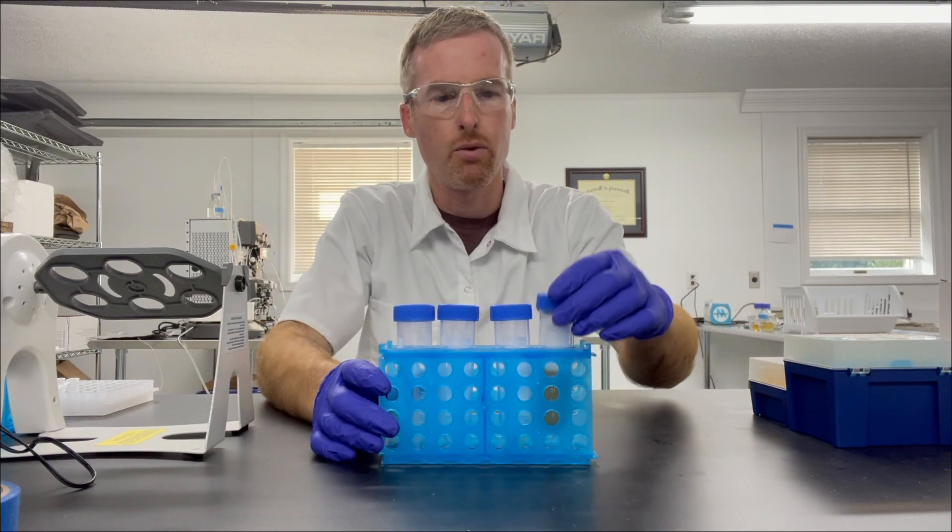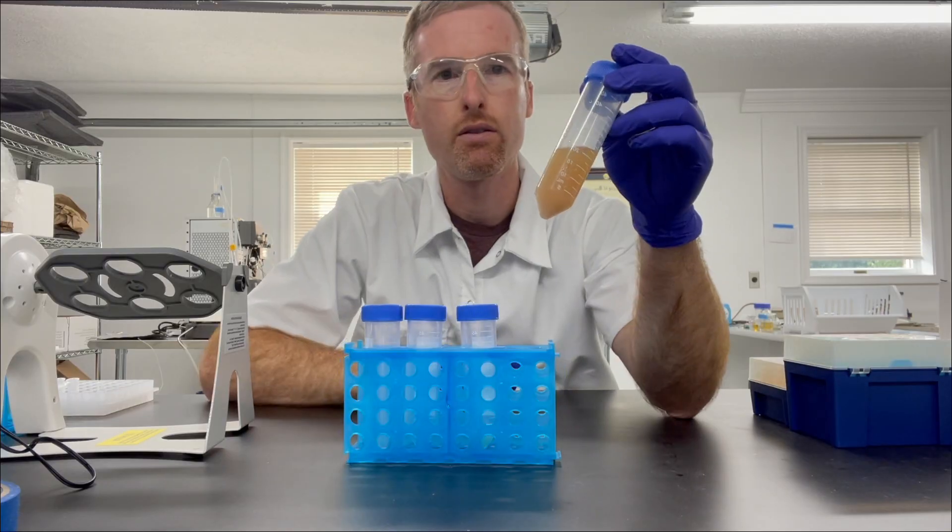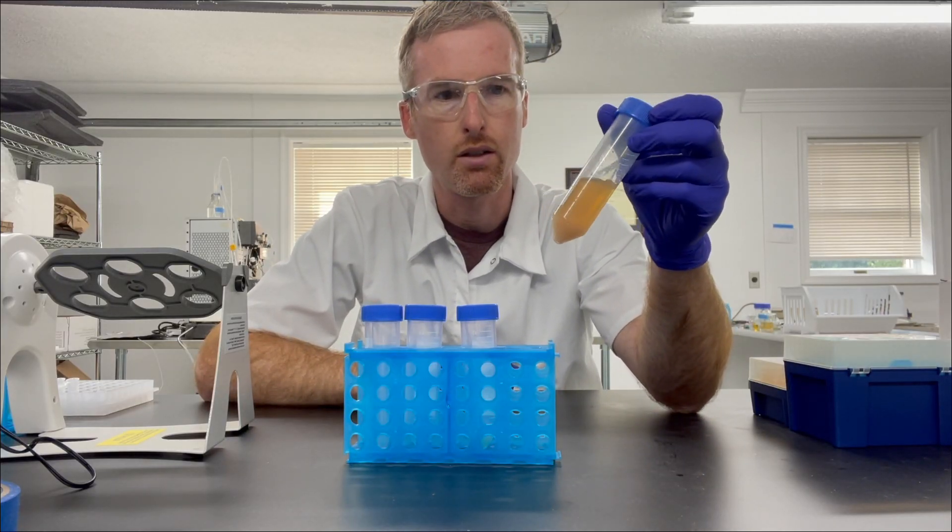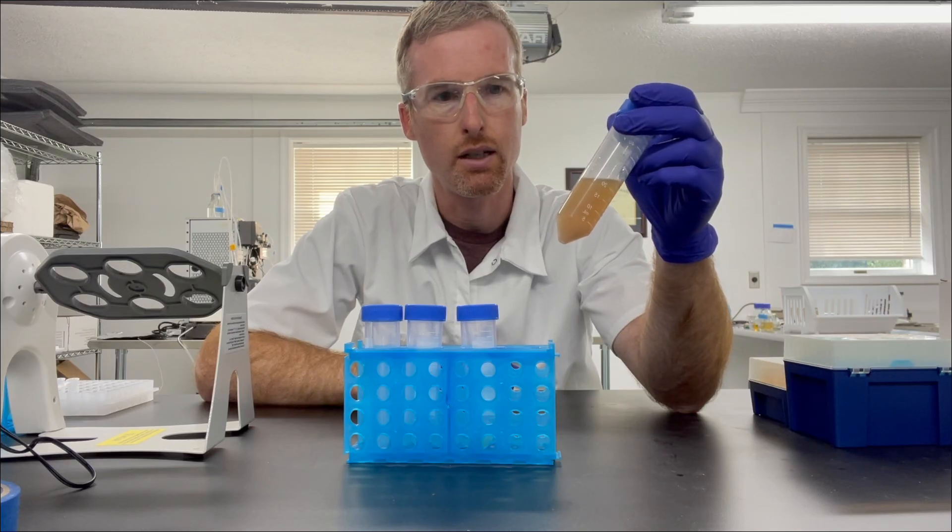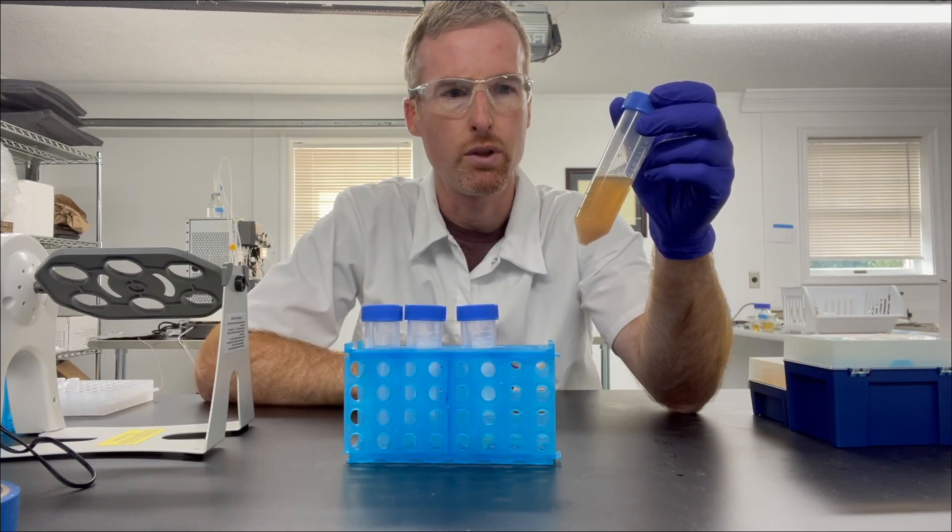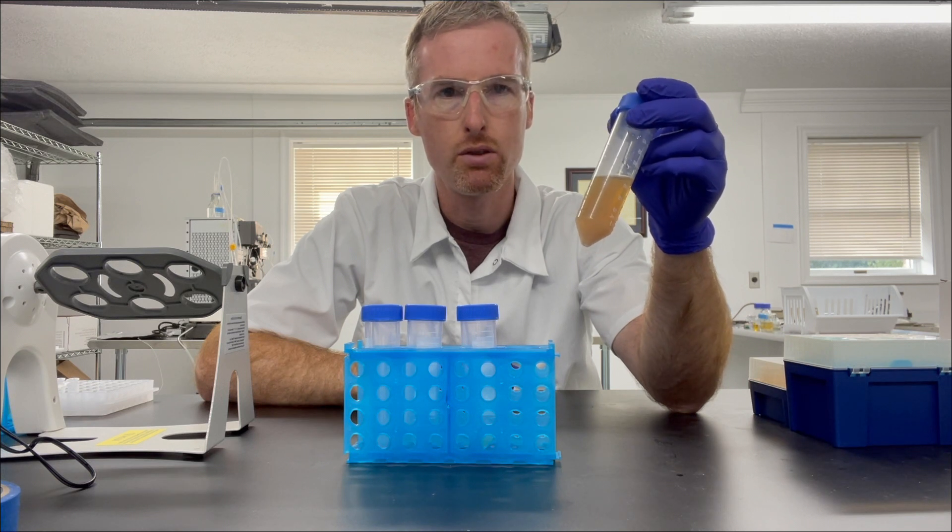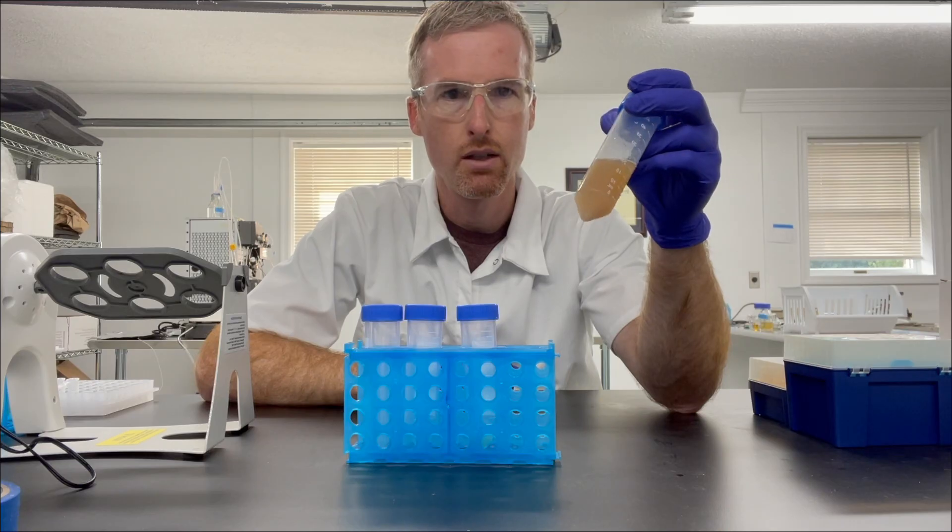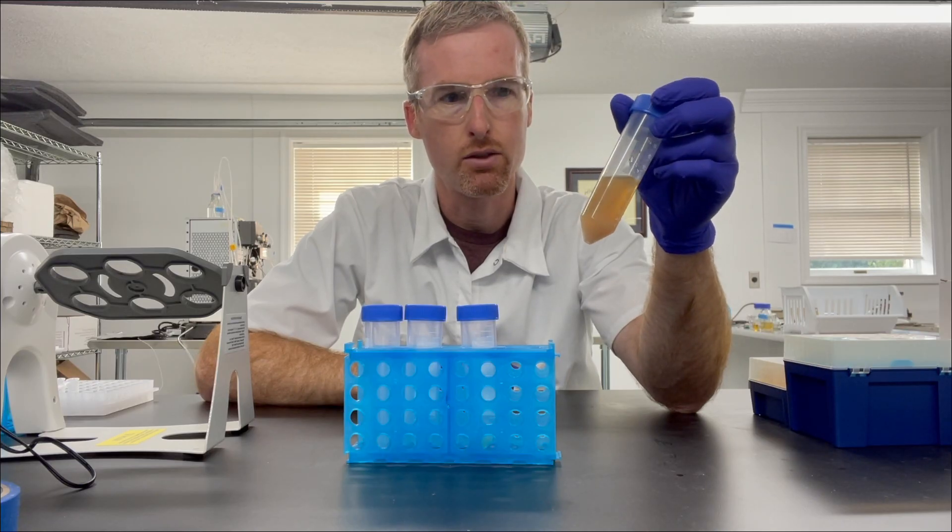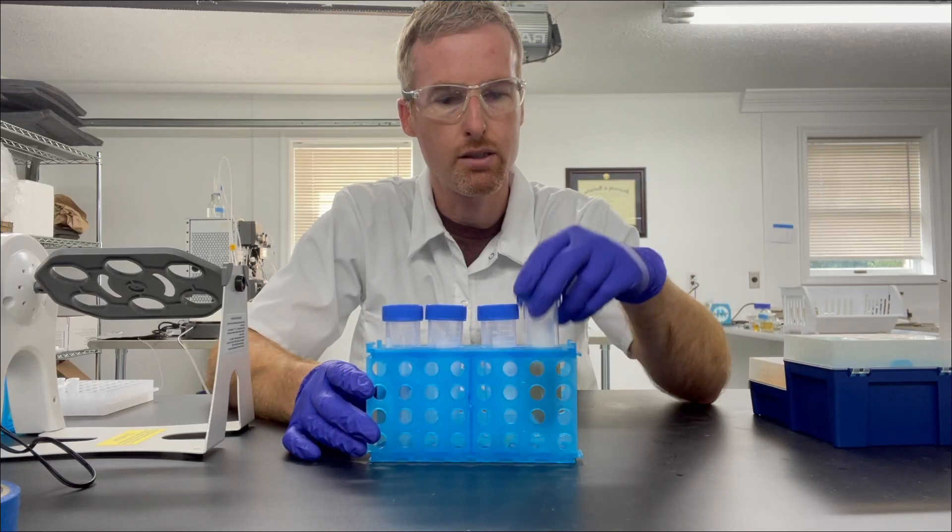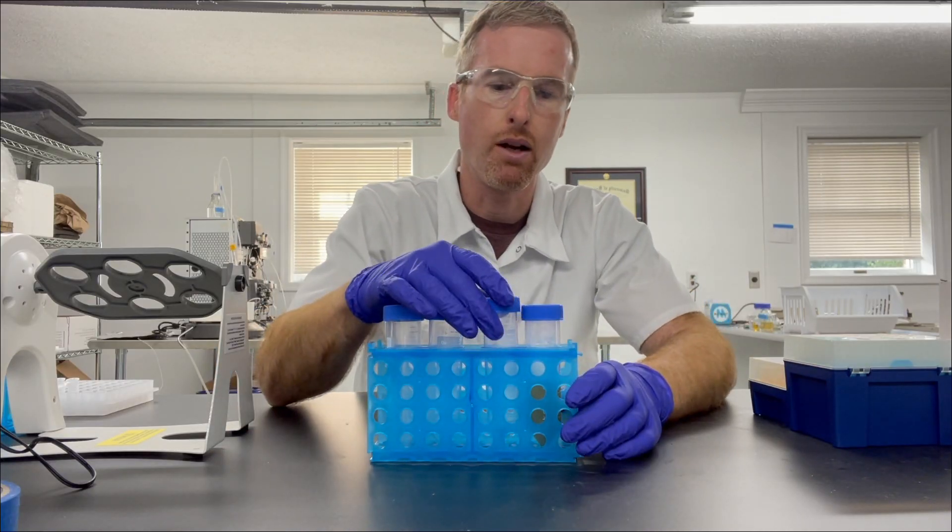So what I have here is some E. coli cell lysate. These are E. coli cells that I sonicated and went through a high-speed centrifuge step, and then I took the soluble components of the cells, this tea-colored solution here, and I left the insoluble cell debris behind.